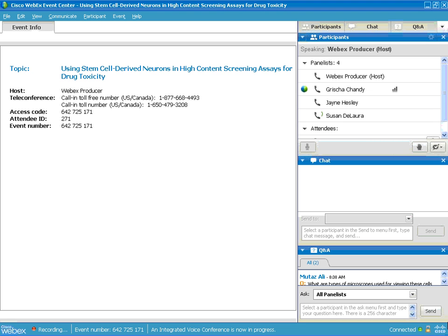The answer to that is yes, we have done staining as well as flow for GFAP with our neurons. And we do not see any staining, nor see it by flow, right out of cell or over time. We have continued to culture the cells and then reanalyzed them, I believe, at days 14 and 21, and we still don't see any presence of the glial cells there.